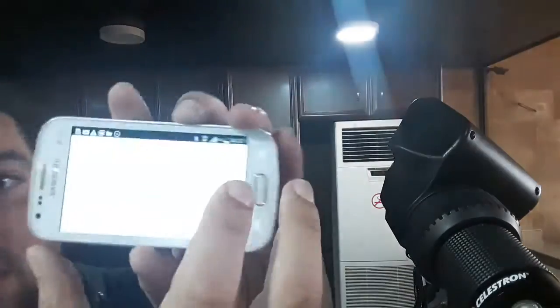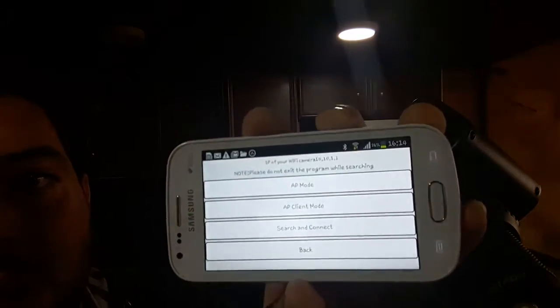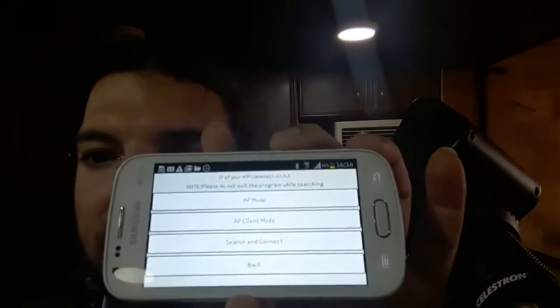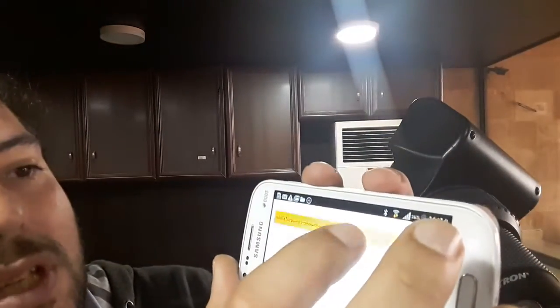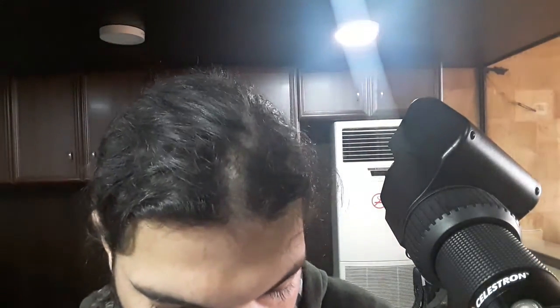In the app settings — accessed through the gear wheel — you can connect the camera to an existing access point. Go to AP client mode, select one of the available access points, and type its password. This way all your friends can see what's on the camera while staying connected to the internet at the same time.